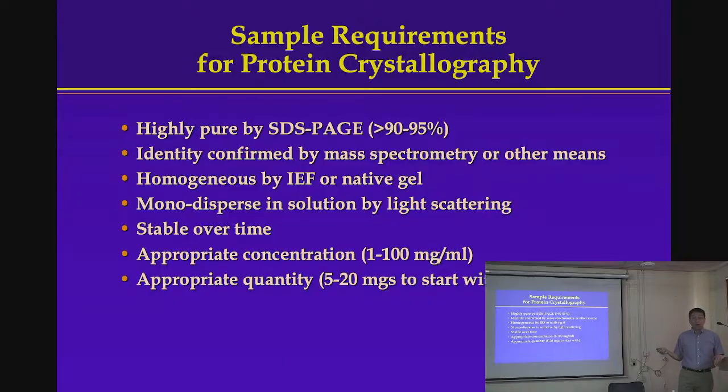So how do you tell quality? First, purity. You run the SDS gel. Oh, you all know about SDS gels, right? Good. Thank you. So it has to be very pure, 95% pure. Basically a single major band on the gel. And then you want to make sure the protein purified actually is your protein. Sometimes you will have surprises. You're chasing a band on the gel, sometimes you chase the wrong band, and then you purify the wrong protein. You don't want that to happen.